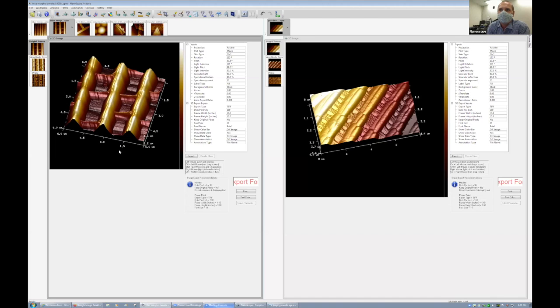That was, I guess, the question. It depends also on its thickness, the size of the material. Just like thin film. Yeah, right. Okay, that's what I was wondering about on the second one, because it's red and then orange, yellow.